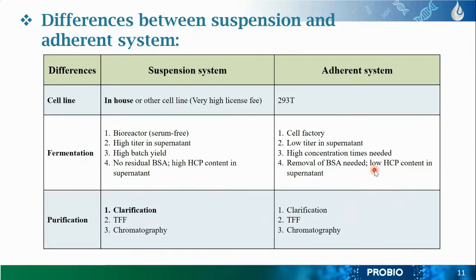And I would also like to say a few more things about it. The adherent system is laborious. It requires a lot of space. It takes time. So it's much more feasible to go for the suspension system.